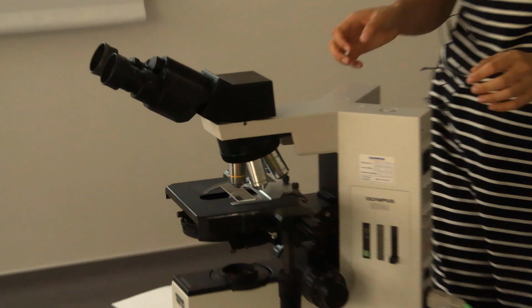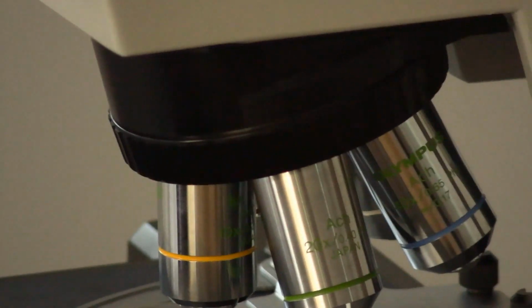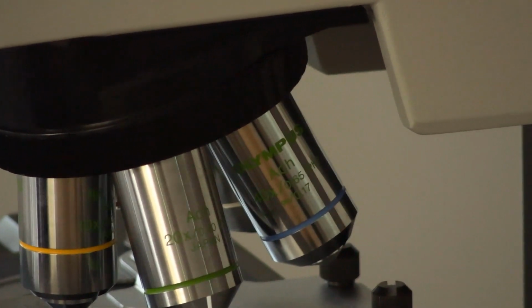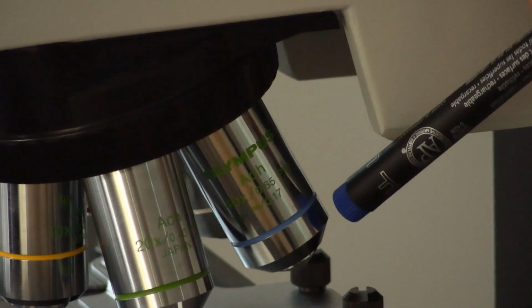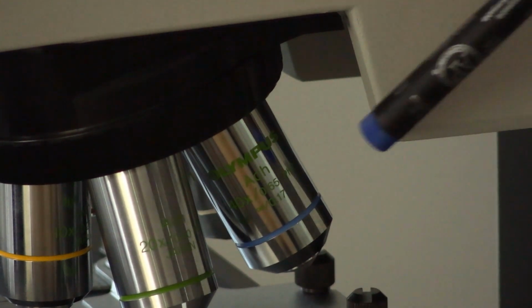And here I show you a real objective. You can see there's information on this objective here. The light blue line means 40 times magnification.